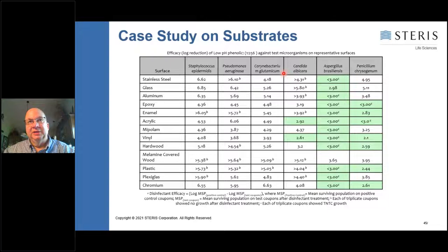You'll notice here with the vegetative bacteria, they easily hit that number with no problem. However, they had a couple of issues with some fungal, or actually yeast testing, the Candida. That may be artifact. It may just be due to the operator doing the tests, which can happen. But over here, you see some real issues with the testing with the mold spores.